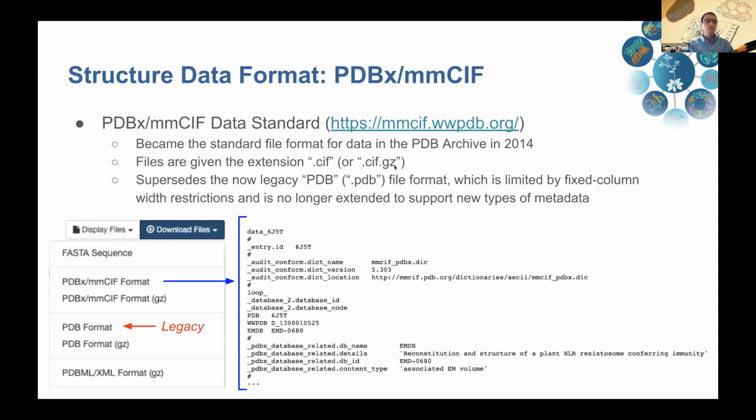For those who have worked with data from the PDB in the past, chances are you're familiar with the legacy PDB format file, or the file with the .pdb extension. And I suspect many people may still be using this, but since 2014, we've stopped supporting extensions to this format in favor of the PDBx/mmCIF format.